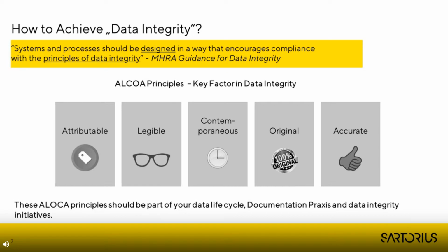That means the record contains all metadata like username, instrument, and timestamp, and not only a pH or weighing value without any information around.